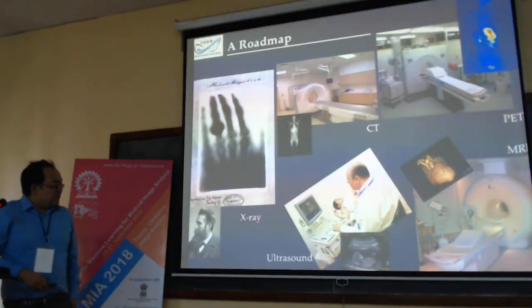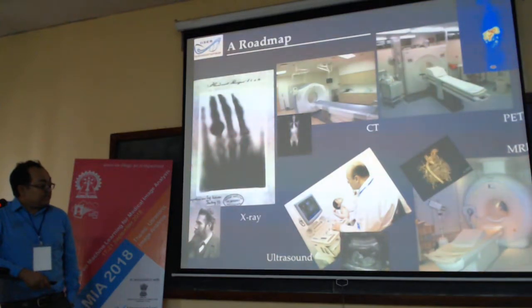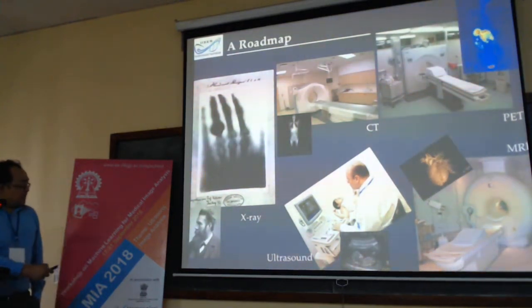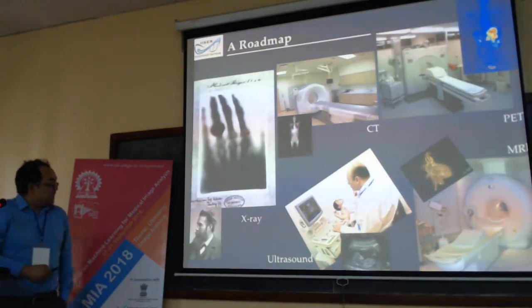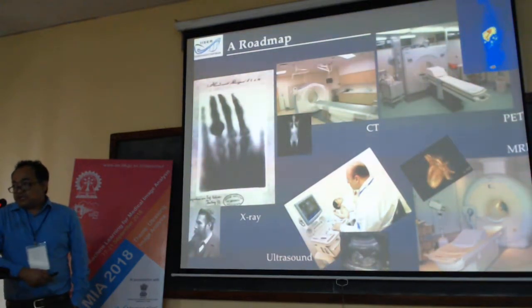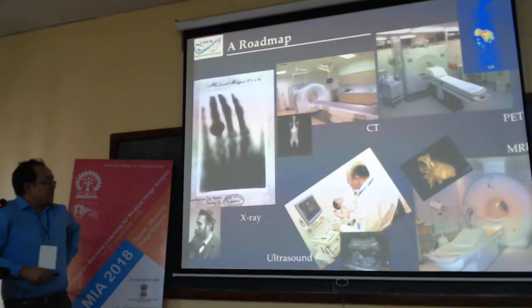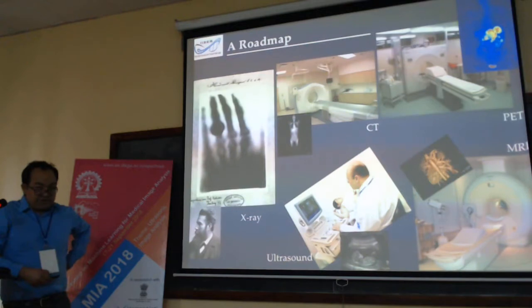All these imaging systems have positive advantages as well as negative points. Just to say that X-ray imaging gives 2D images. Not only the 2D images, it is the dimension wrapping of the 3D to the 2D. So the 3D distribution is mapped towards the 2D information, and ultrasound imaging gives 3D imaging.